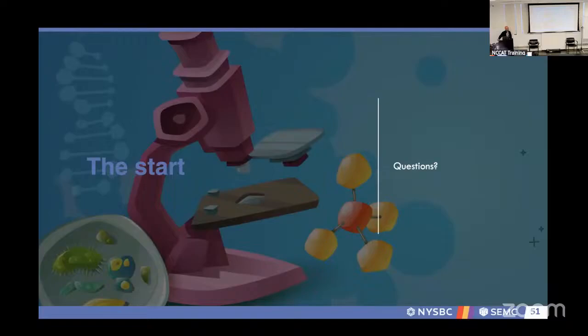There are situations when an electron is hitting your sample inelastically, and it's either losing or gaining energy, and then it will project on a different plane. But at the angstrom level, we tend not to really need to worry about that. We have picometer wavelengths, and we can be several orders of magnitude pretty poor with our microscopy because we're really going after angstrom level data.